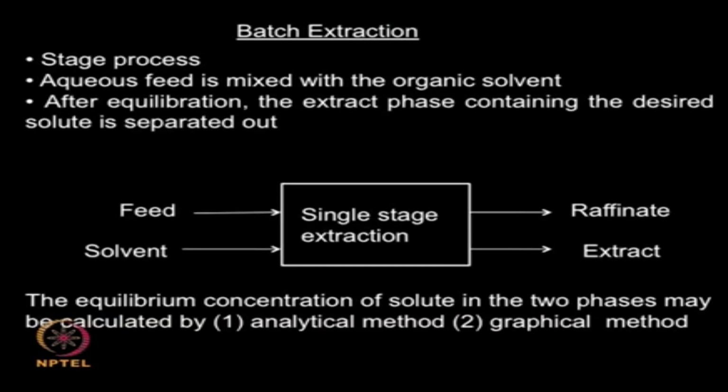Let us look at the batch extractor. It is a stage process. The aqueous feed is mixed with the organic solvent, and then once they have reached equilibration, the two layers get separated. Your desired solute is present in the extract, raffinate is the spent feed, and both these streams are taken out.